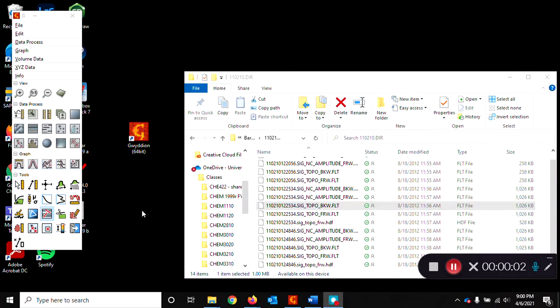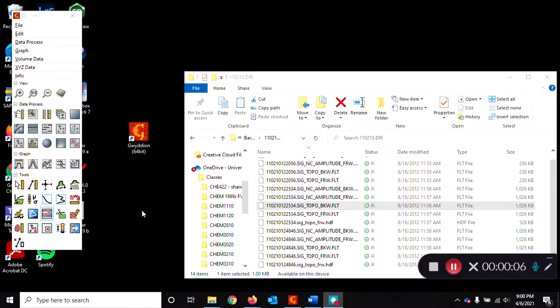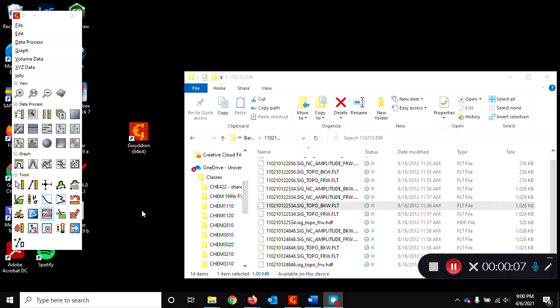In this video I will show you how to use the Gwydion SPM analysis software to measure the size of gold nanoparticles from your AFM image.